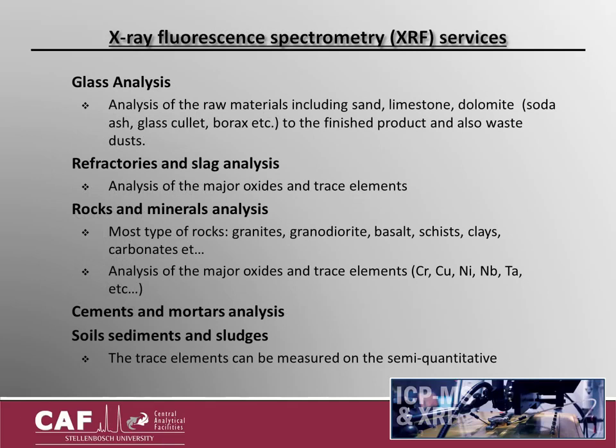XRF analysis can be done on a variety of samples, from solid samples to liquids, inorganic or organic material.